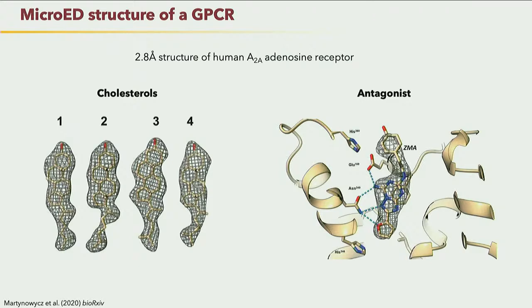And really, honestly, for proteins, in my opinion, the cryoFIB is going to be an essential tool. I mean, unfortunately, it's a $1.5 million essential tool, but it makes the process a lot easier, because then you just find your crystals and, okay, maybe you got a great crystal, but it's like 1 micron. It's just a little bit too thick. You just shave off the top with the cryoFIB, put it in the microscope, and collect data from it. You don't have to worry about trying to find the thin crystals or break the crystals apart. You just use the FIB mill to get them down to size.